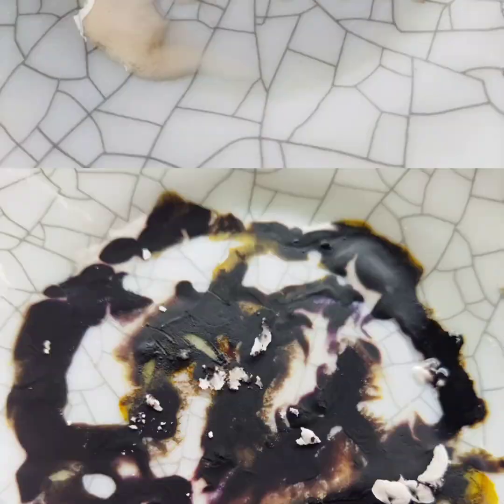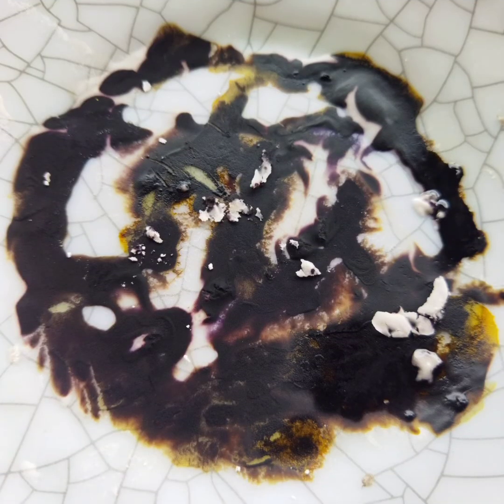Get a pinch of the extracted starch from the potato and mix it with distilled water. Then add a few drops of iodine to the mixture of potato starch and distilled water.